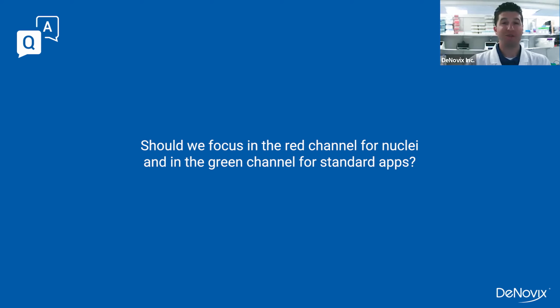We expect that our isolation went well. We have no reason to suspect otherwise. So we would want to focus in the channel where we have the most spread evenly across the screen. We want to have the ability to focus and expose where we have a large number of events all across the screen to make sure that the exposure and focus we pick is applicable for the whole sample we're counting. We don't want to do that somewhere where there's very few events.